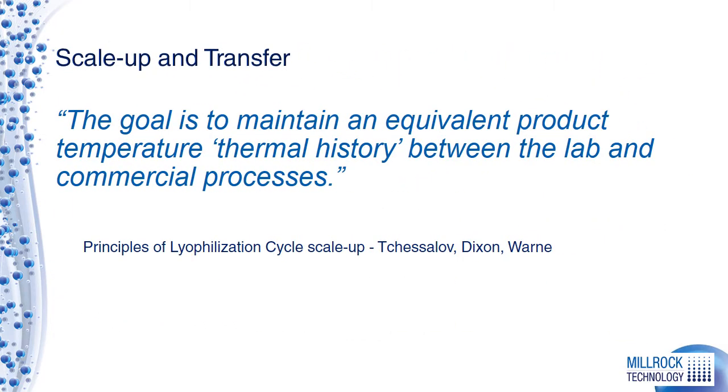A little discussion on scale up and transfer. The main goal is to maintain an equivalent product temperature or thermal history between the lab and commercial processes. So the instrumentation that we use for developing protocols needs to give us the critical process parameters to ensure that we understand the thermal history in both the source or lab system and the target or commercial process.